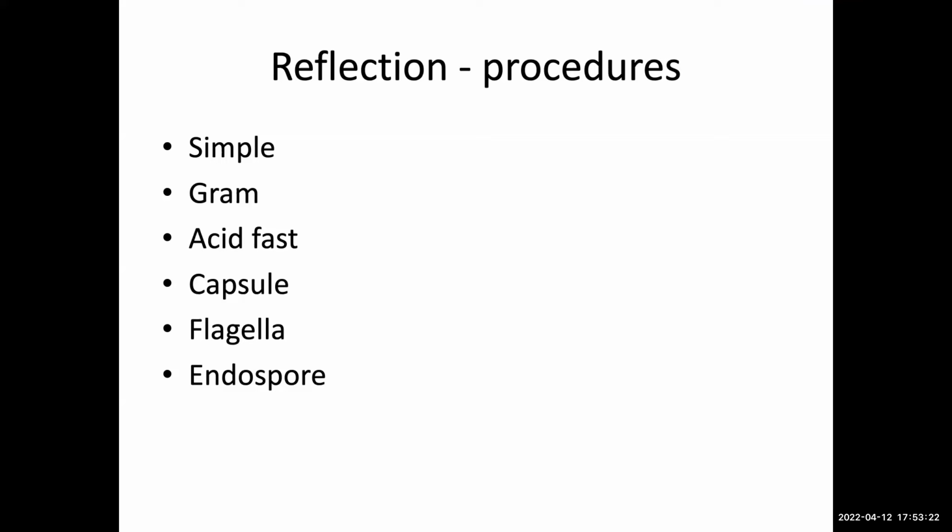For gram staining, I have that there's 4 steps written down. The first step is that the primary stain is added, which is crystal violet. And I also wrote down, based off that chart that you provided, that the first step will stain all the cells purple. The second step is using a mordant. So in this case, it's the iodine. And then the cells will remain purple with this step. The third step is adding alcohol, which is a decolorizer. So then the gram-positive cells stay purple and the gram-negative cells become colorless.